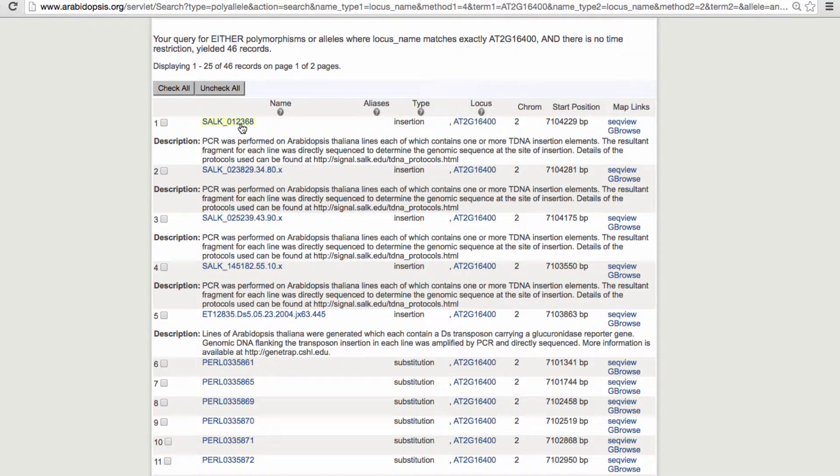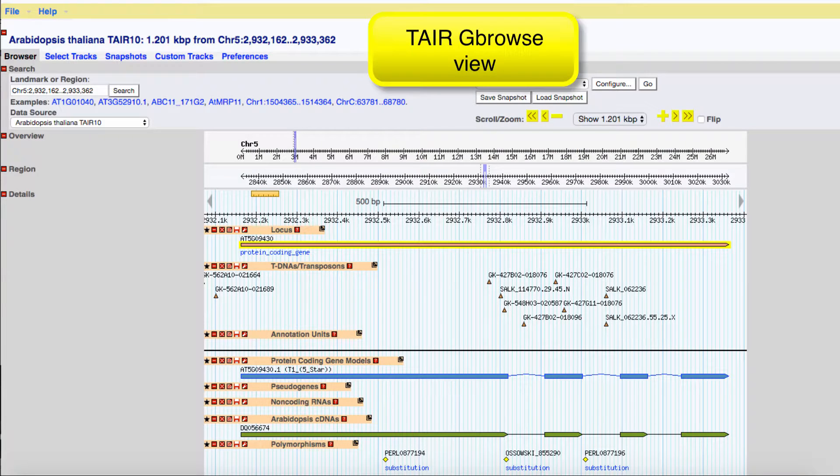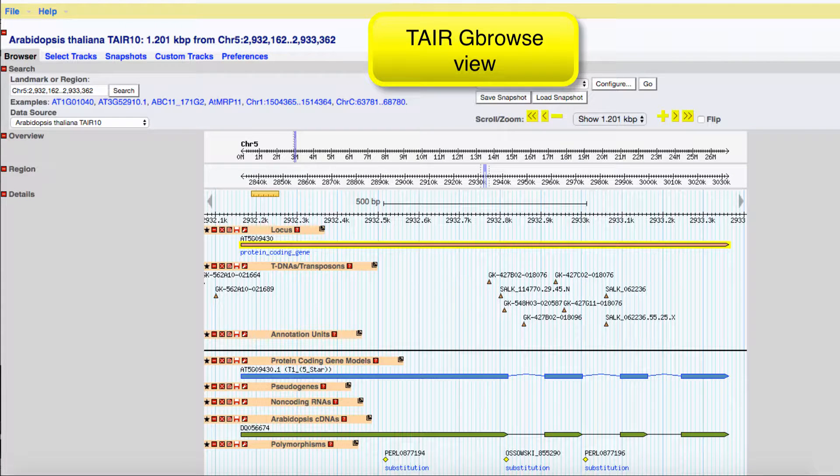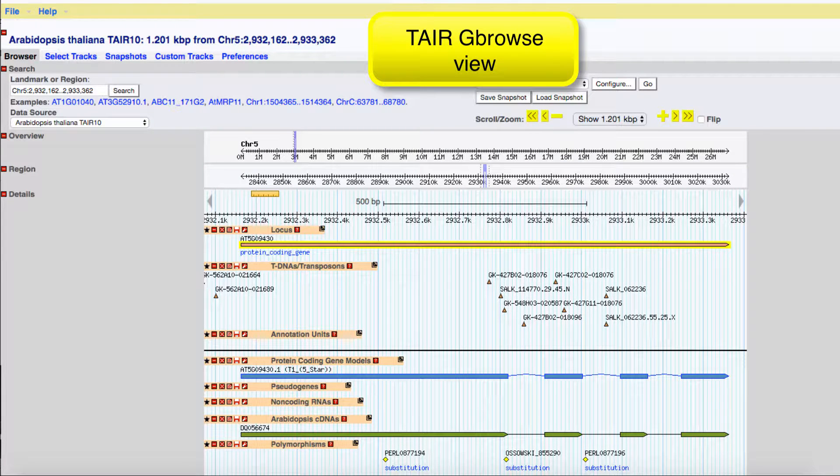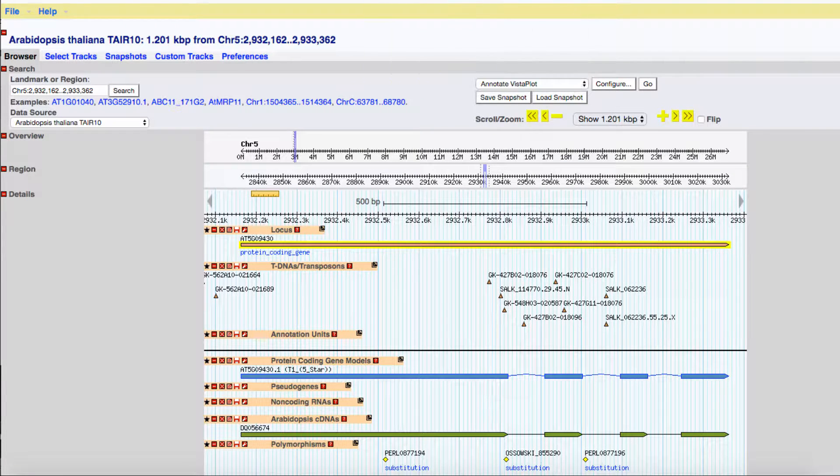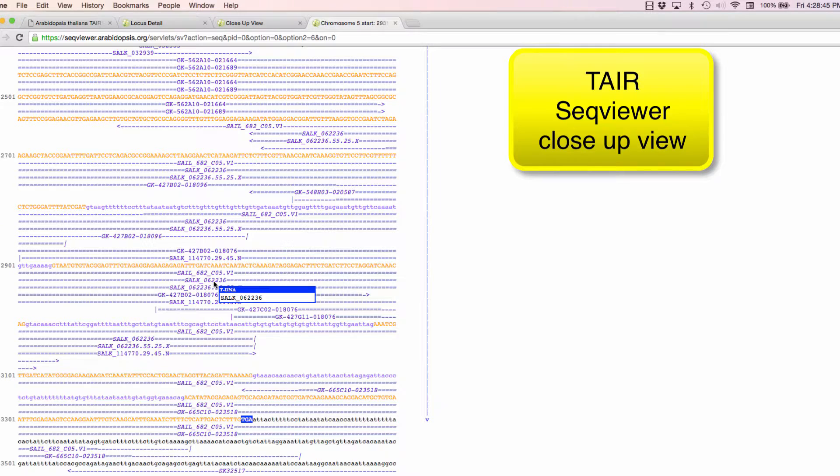For example, if you're using TAIR's GBrowse, you can find an insertion that looks like it's in an interesting position and click on the name to view the polymorphism detail page.